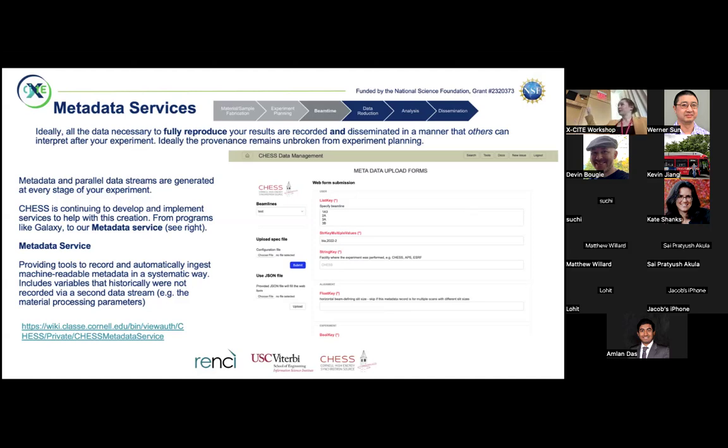There are also, other than being able to fill out these types of metadata pieces, going to be so many parallel metadata streams, or you might even just consider them data streams, that are going to be happening at Chess. And so there will be many different ways to access that. A lot of times your Beamline's technique will have already integrated some of the essential pieces with your scans. So for instance, the incoming flux of the beam, how many photons are coming into your hutch, so you can normalize against that number with the data that you have.